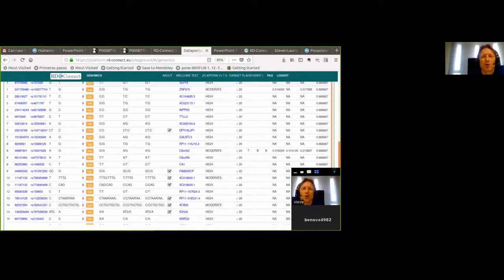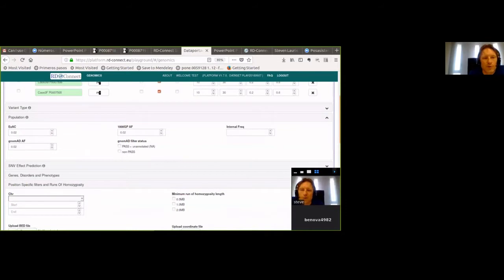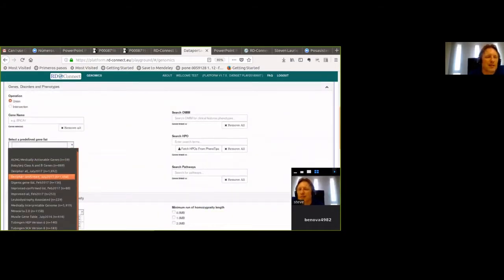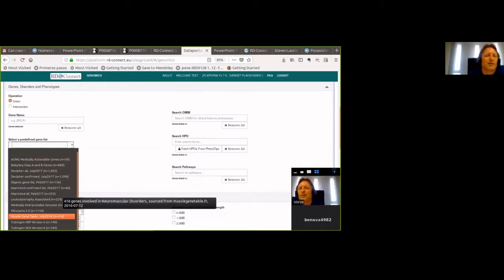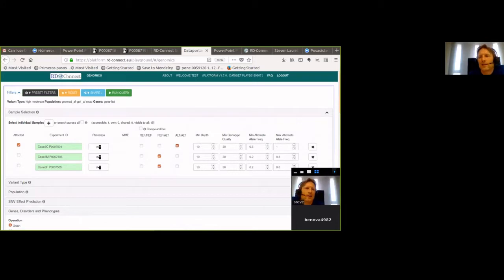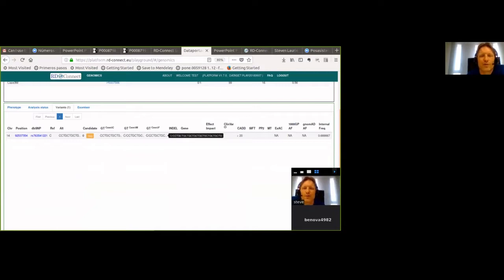With 26 variants, we're in the realm where you could almost look through them manually. If you know which genes are likely involved in your case, you'll probably spot them directly. For extra help — for example if you're not an expert in neuromuscular diseases — you can filter by the Muscle Gene Table list of 416 important genes. Running that query returns just one variant: a large insertion in the gene Ataxin-3. The parents are carriers of the insertion and the child is homozygous for it.